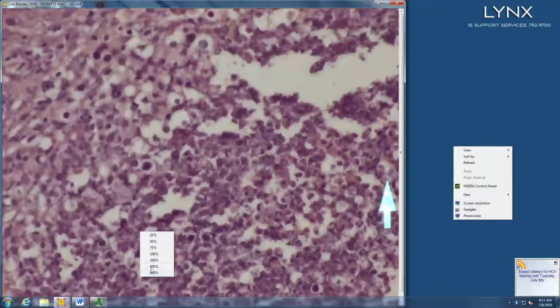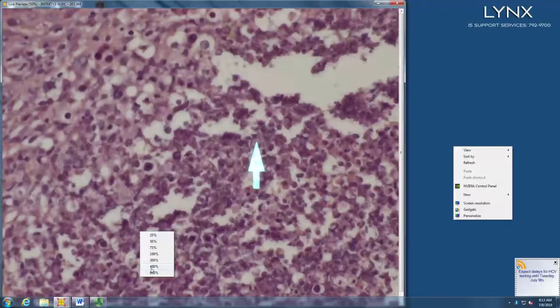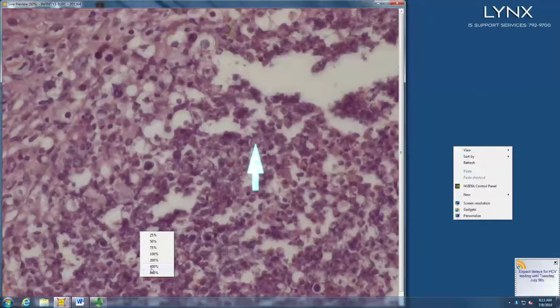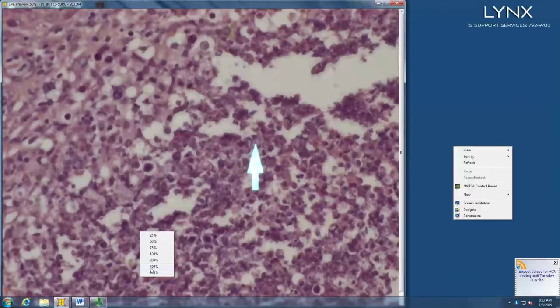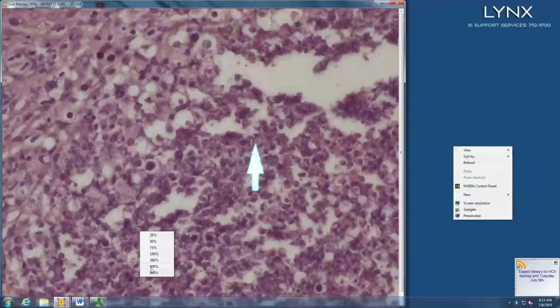Like a cluster of cells that looks very similar to what happens when an ovum becomes a morula. Yeah, so Prototheca. So protothecosis. One of the things that can help if you have a fluorescent microscope: Prototheca autofluoresces really strongly.